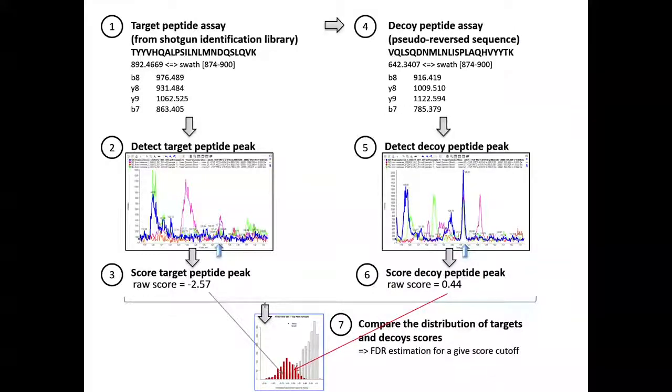There's a lot that goes into these thoughts, but in general, reversing the sequence, or taking the last residue, not the lysine or arginine, and moving it to the front, tend to be the two best ways that we've found. Yeah, I think what Ludovic said, though, is that what you don't want is your target to look too much like the corresponding decoy, right?